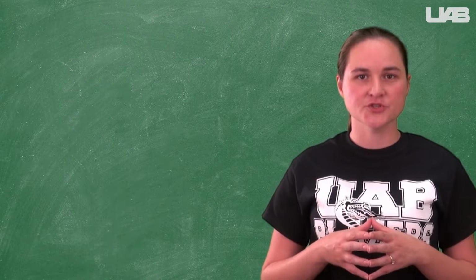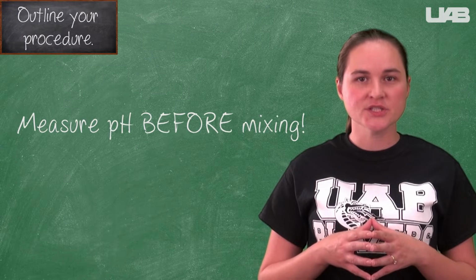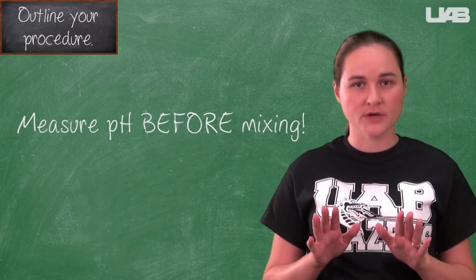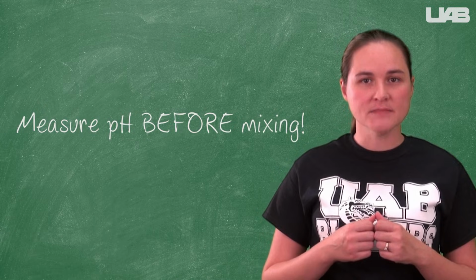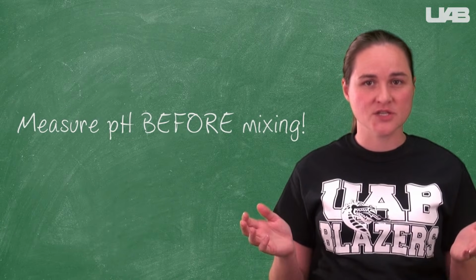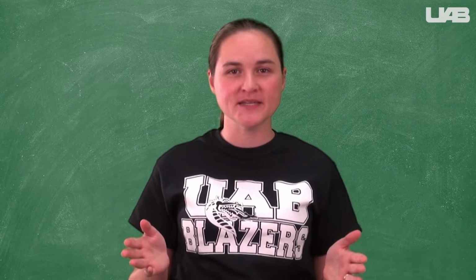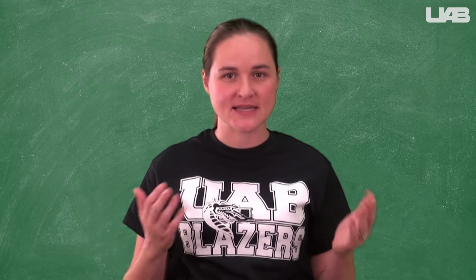Taking the pH of a solution is a great first step in being able to identify it, but be sure to take the pH of each solution before they are mixed. Since we aren't mixing our solutions quantitatively, observing the pH after the reaction occurs will do us no good. We would essentially just be getting the pH of the reagent present in excess.